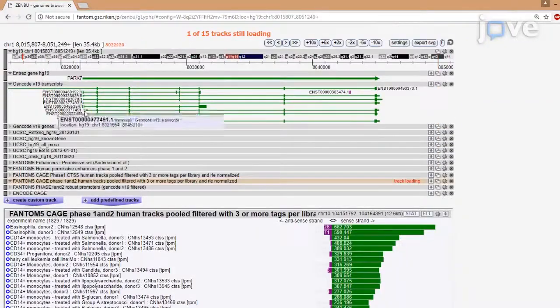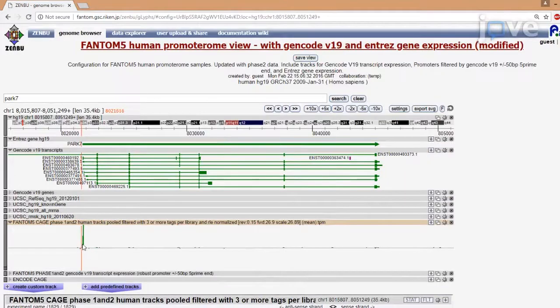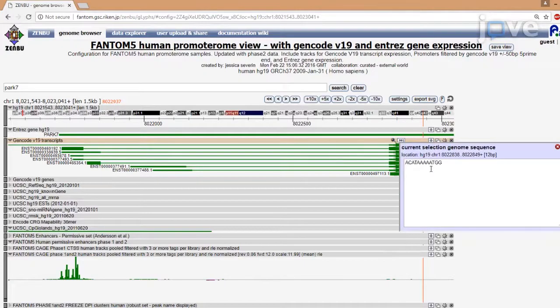To determine cell and tissue-specific transcription expression levels, select the CAGE peak region and click on Magnify Genomic Region to selection. Check Park7 expression in the cell and tissue type of interest by exploring the transcript expression list at the bottom of the page. Then design binding domain sequences of several different lengths, corresponding to 40 bases upstream and 32 bases downstream of the first methionine or AUG.